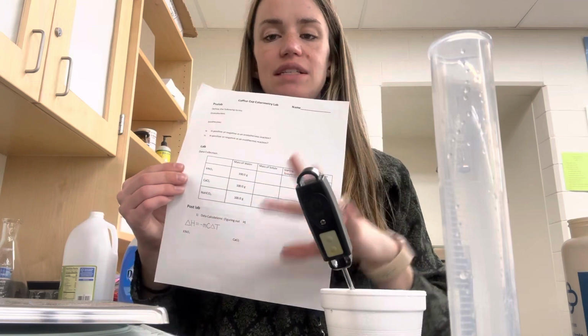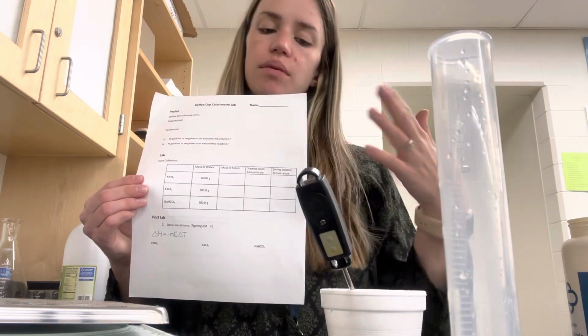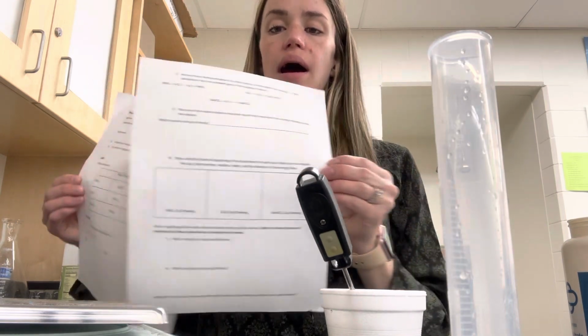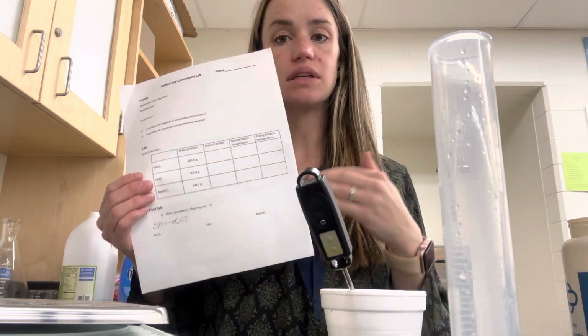I will do the tests, I will post the data or the pictures online, and you'll write in what numbers you see from the scale and from the thermometer from the online pictures on your data table. Then after that, you can do the rest of the lab with that data. So you have to get this data first from the pictures online. All right, the rest of the lab is a little bit tricky. There's lots of pieces and parts to it.